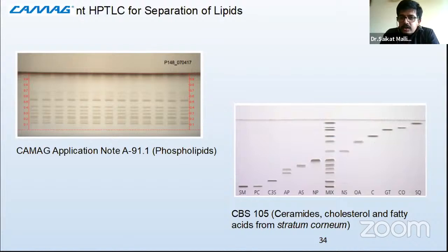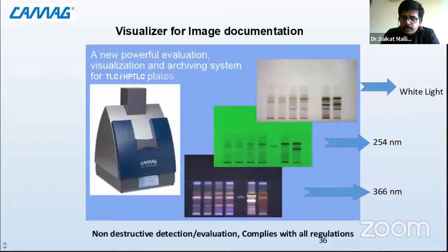I'm sure you know the term cholesterol. Somebody's parents or doctor every time tells you that you have to monitor your cholesterol or keep everything in mind. So this is an example of that part, of fatty acids, fats and oil, which are being separated with this approach. So like that, very difficult samples can be analyzed with this approach. It has very high resolution power.